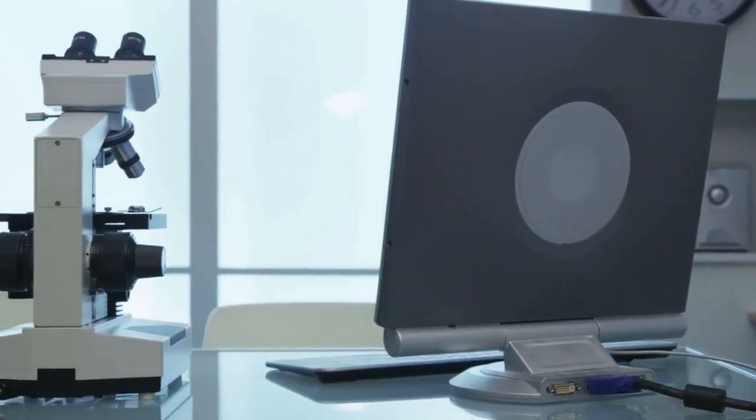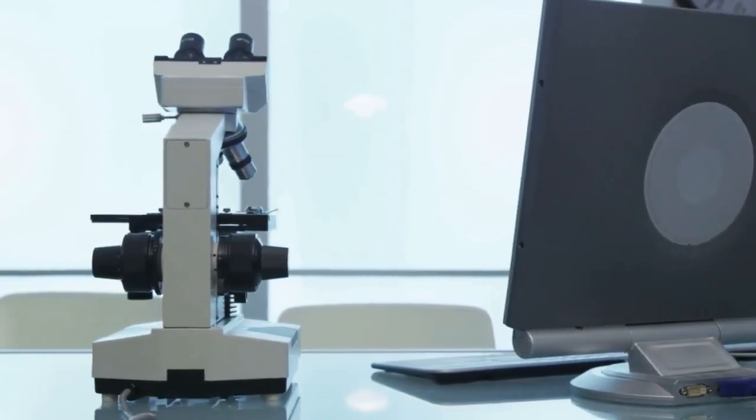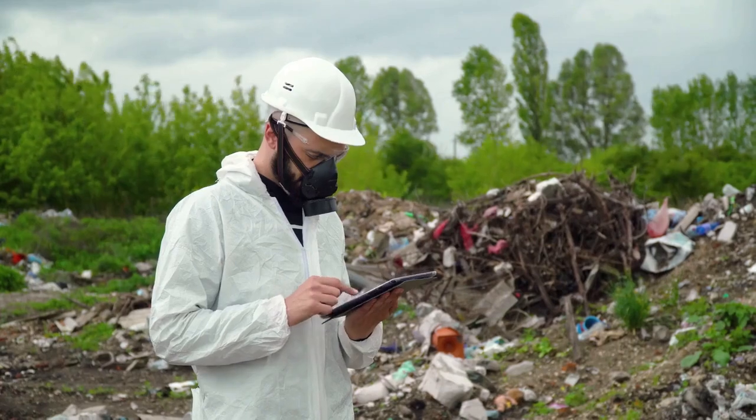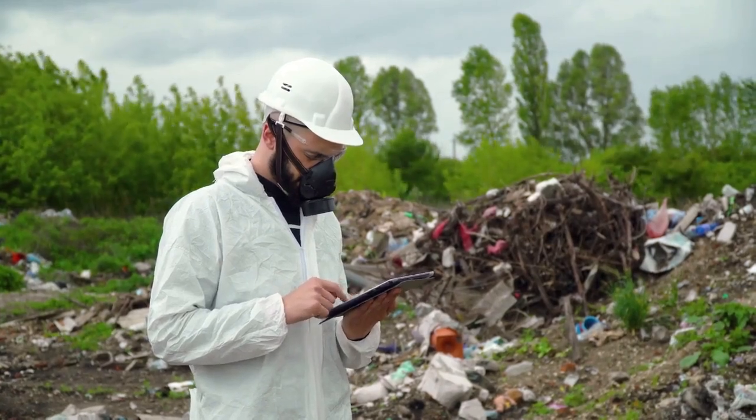This technique is incredibly useful and is applied in many fields, from pharmaceutical analysis to check the purity of drugs, to environmental monitoring for detecting trace pollutants.